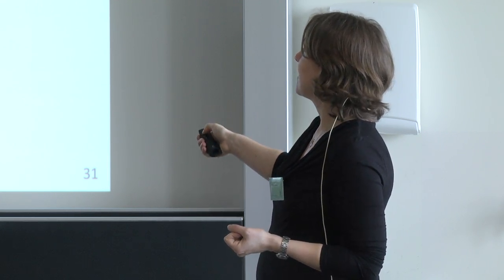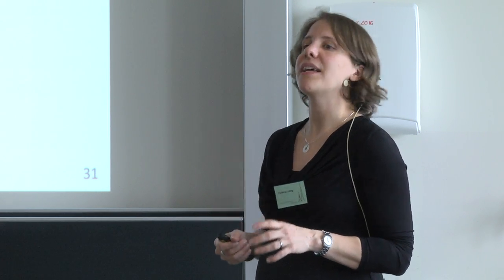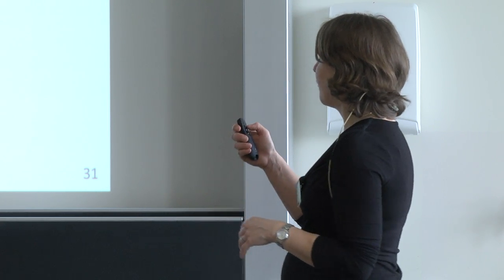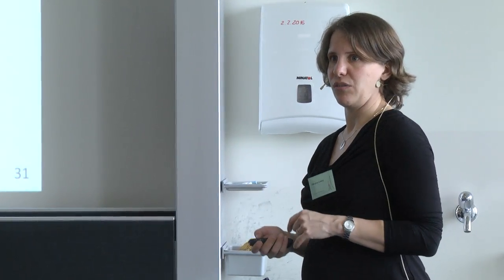So you must take the signal intensity just as one criterion out of several others that you combine, but you cannot take it exclusively. Is that clear? So it's one additional piece in the puzzle that you can use, and very often the most intense peak is also your target peak, but don't trust it completely only on that.